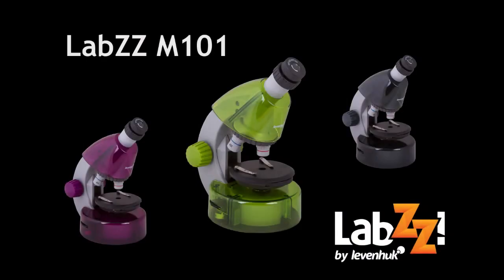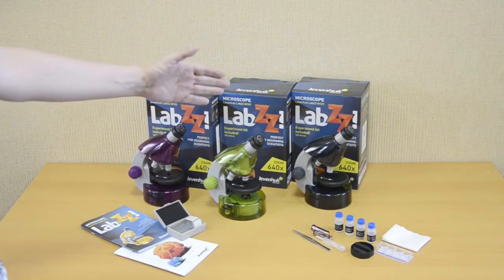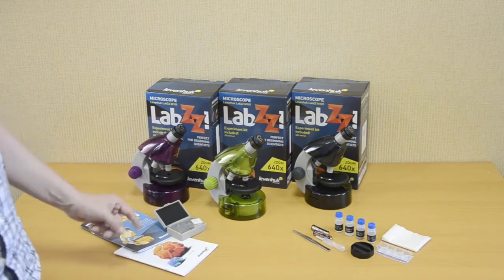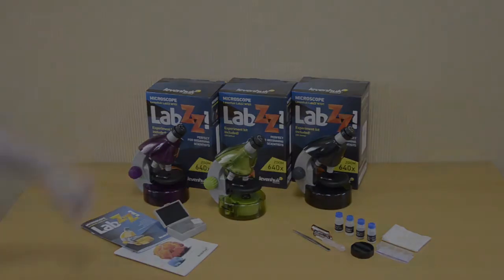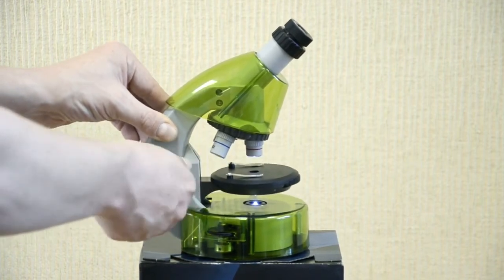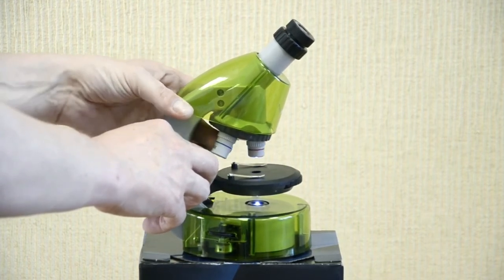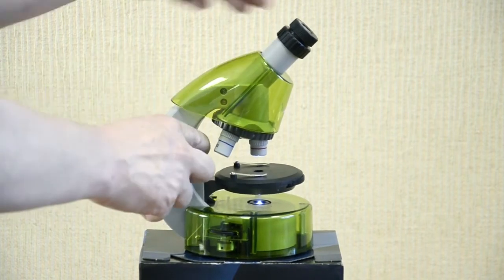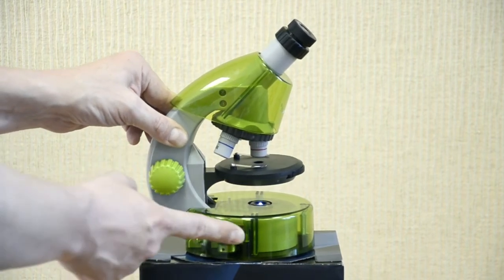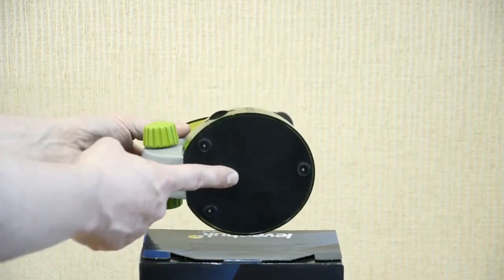For young microcosm explorers, we recommend the Levenhuk LabZZ M101 microscopes with high-quality optics, magnification from 40X to 640X, and uniquely shaped plastic bodies. Each comes with an experiment kit with slides and tools, a user guide, and a bright gift box. Image sharpness is easily adjusted with the focusing wheel, moving the stage up or down. The revolving nose piece holds three objectives. The stage has slide holders. The model features a unique sliding two-position eyepiece at 10X and 16X. The lower LED illumination with adjustable brightness allows observing transparent objects. The microscope is powered by standard AA batteries included in the kit.